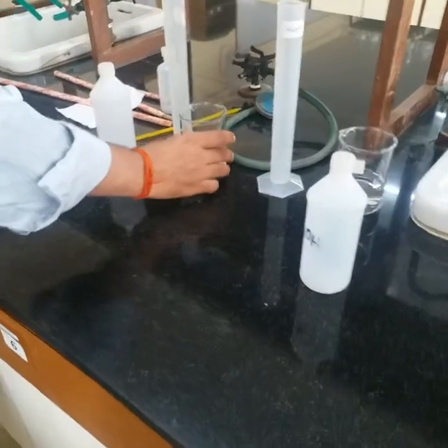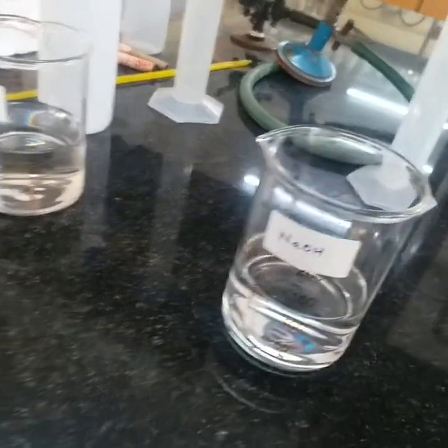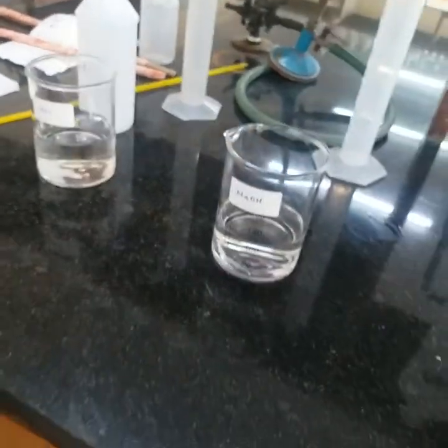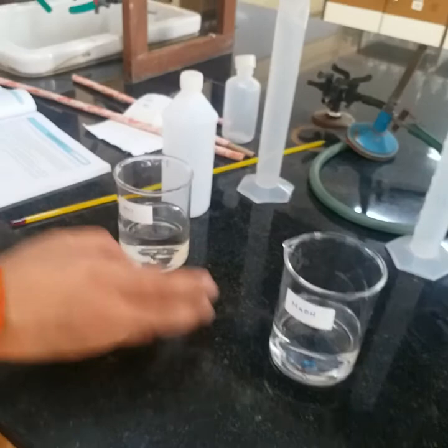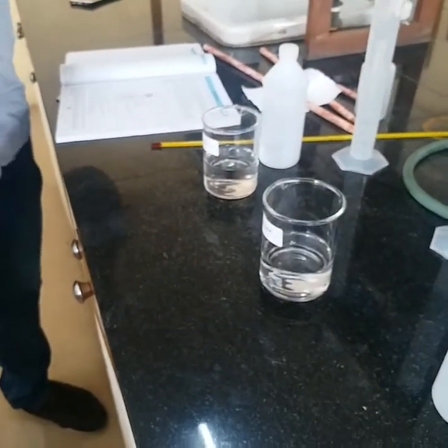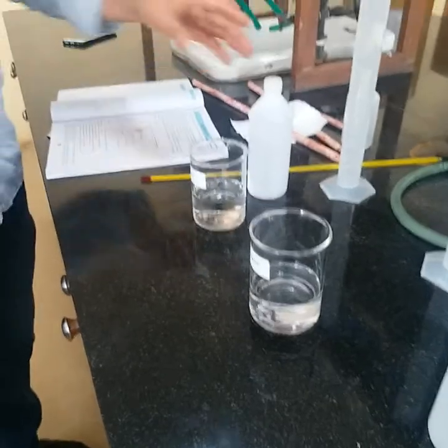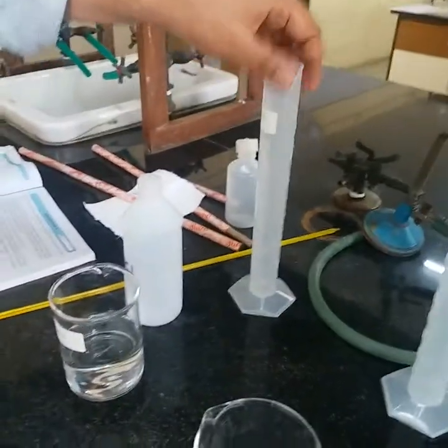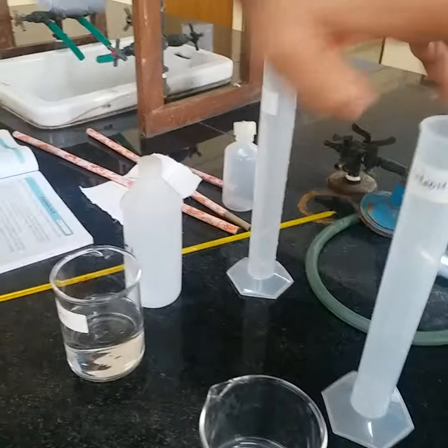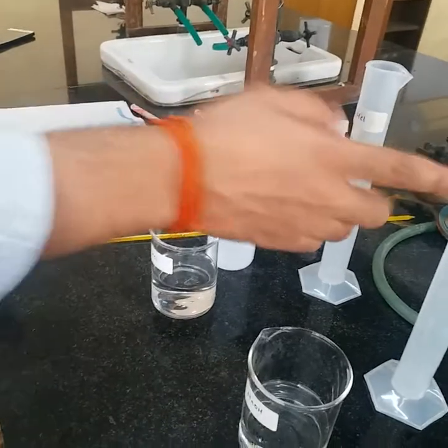We have two solutions which would be given in the exam. This is the stock solution — this is the HCl we have, and the second one we have NaOH. Both are 0.5 molar HCl and NaOH. Here are the two different cylinders; the names are already written on them: HCl and NaOH.